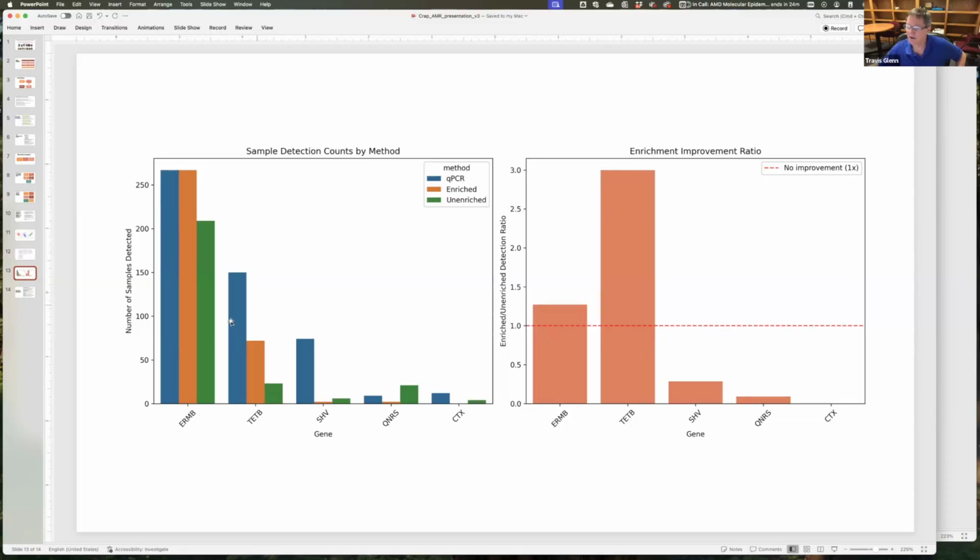Now again, by normalizing, we're minimizing that chance. But if you're simply asking, can I detect it at all, increasing the number of reads, which usually means ensuring you're on one of those cheaper, higher throughput platforms, is a way to get to higher detections.